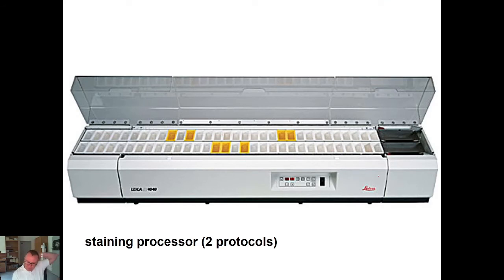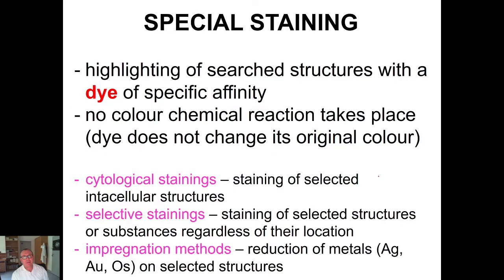Again, when the laboratory is so big that automatization is necessary, there exist staining processors. And now we'll look at special staining shortly. As I already said, the number of methods used for special staining is enormous. There are plenty of methods, and my lecture can contain only a small choice of them.